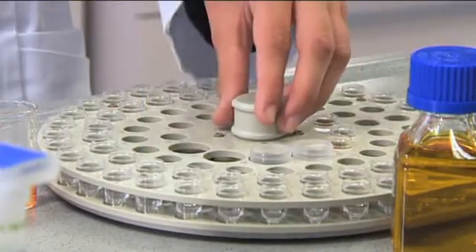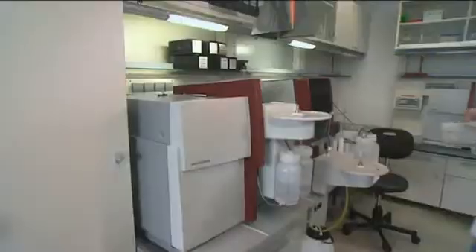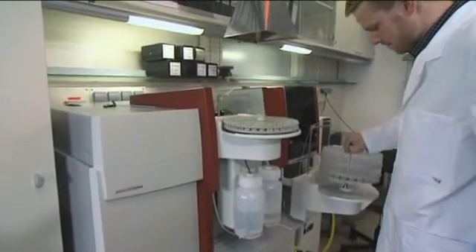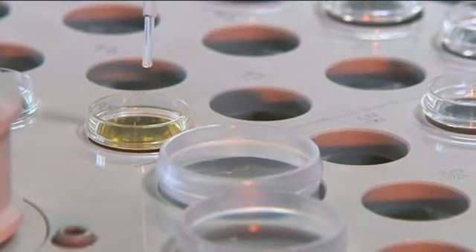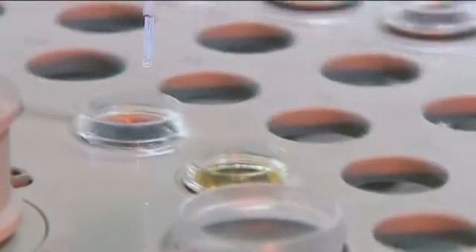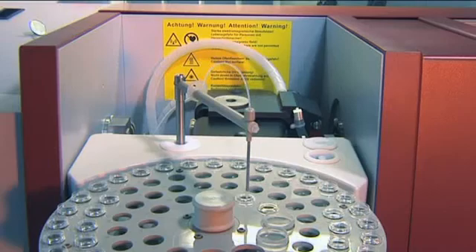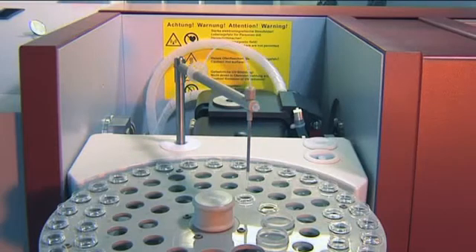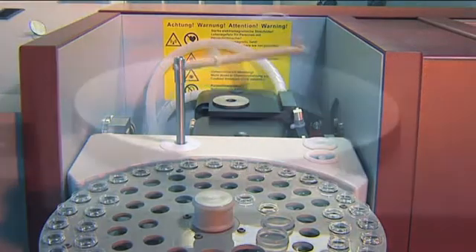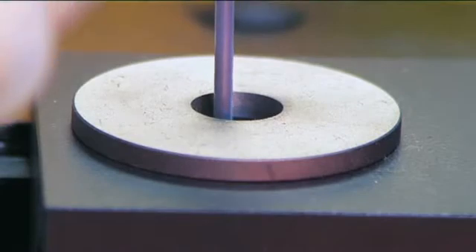The micropipetting unit takes over the preparation of the calibration standards and, if necessary, the dilution or concentration of samples in the graphite furnace. The turntable with 89 positions enables large sample series to be measured automatically.